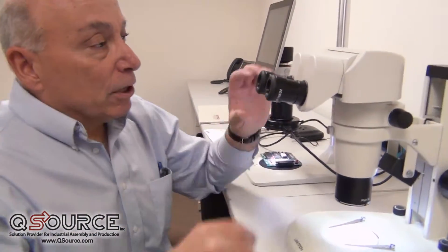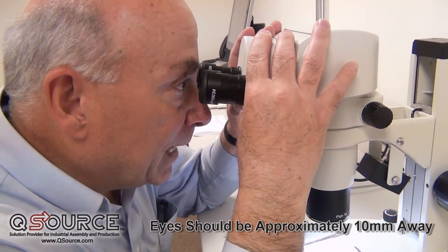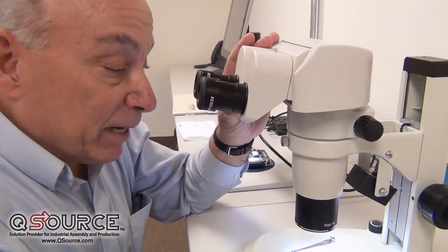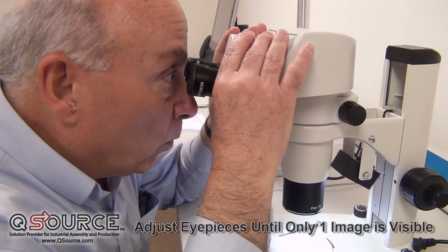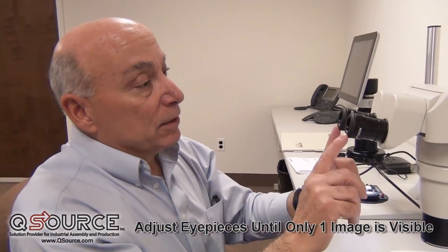When we go to the microscope, we want to put our eyes approximately 10 millimeters away from the eyepiece top lens, and we want to have a specimen imaged so that we see one image, and that's to get the proper interpupillary distance. The light that comes through the center of these eyepieces matches the retinas in your eyes.